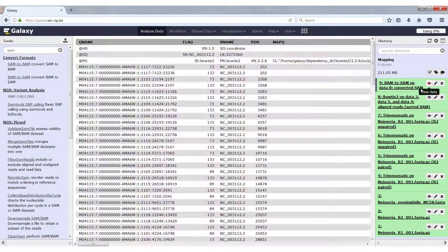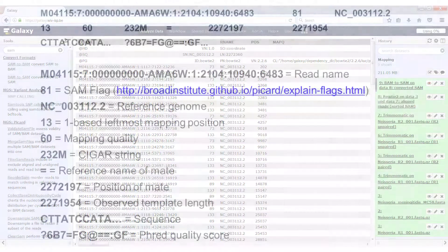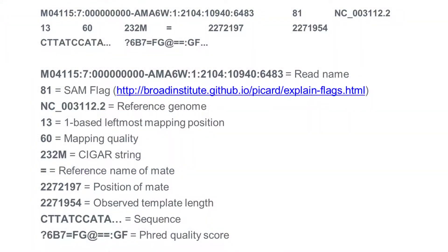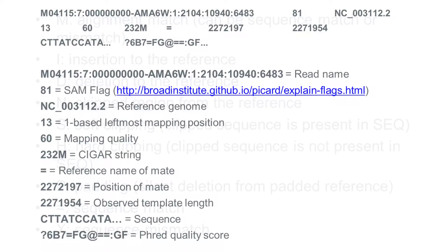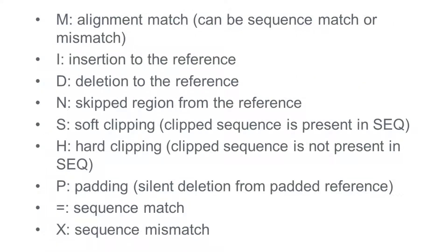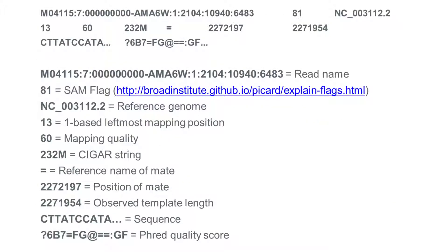If you click on the eye icon, you will get an overview of the file. Selecting one of the lines, we see the different values: the read name, a SAM flag of which you can find the meaning on the Broad Institute website, the reference genome, the position, and so on. One other interesting value is the CIGAR string, which tells you how each base of the read aligned or not. An overview of all possible codes can be seen here. In our example, all 232 bases of the read mapped correctly to the reference.